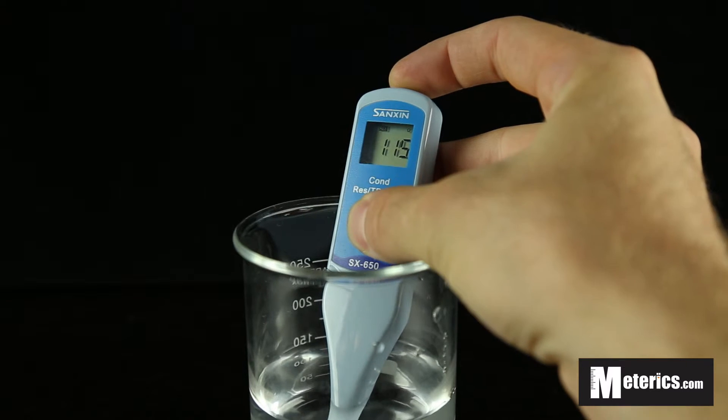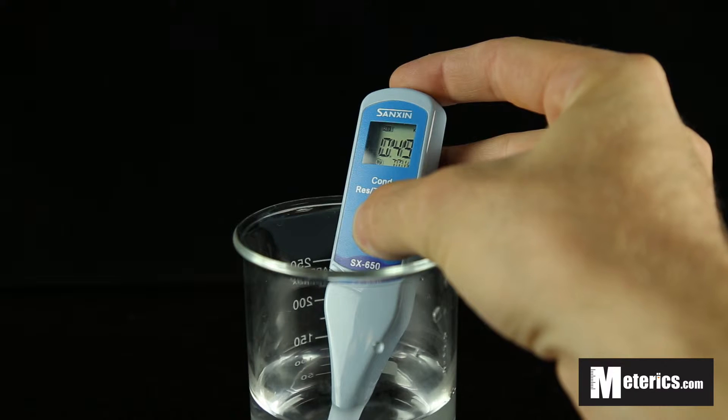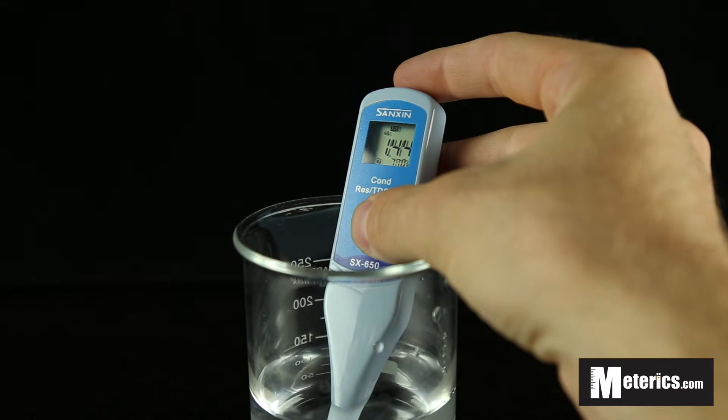Now you can see we've switched to resistance. Hold it down again. Now we're measuring TDS.